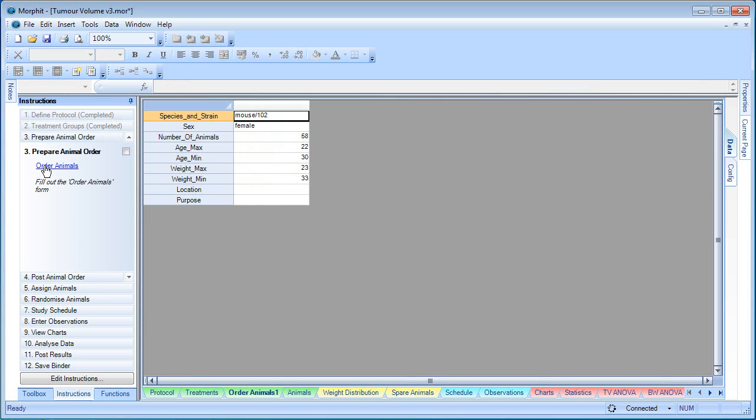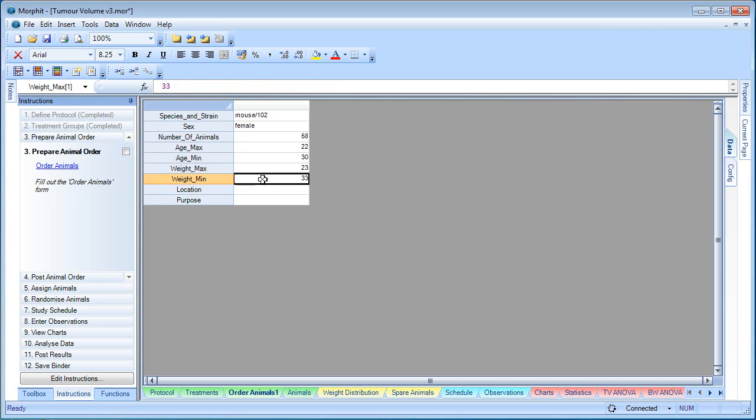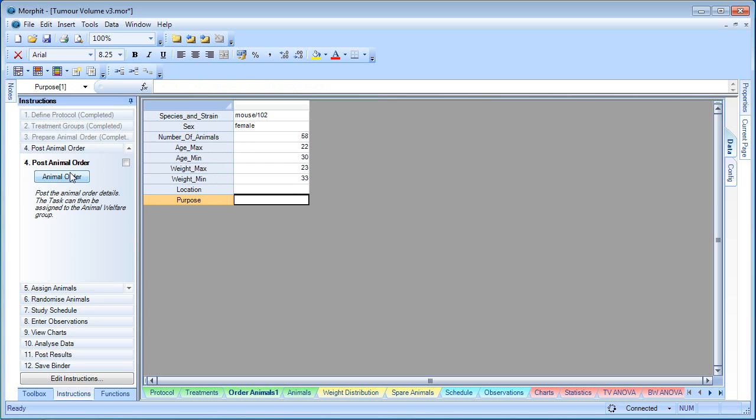As we know how many animals we need, we can now submit our animal order. We can calculate that from the sum of the animals required in the treatment groups, plus a fudge factor, perhaps extra 20%. We have some default parameters in here for the animals. We can fill this out and post it.